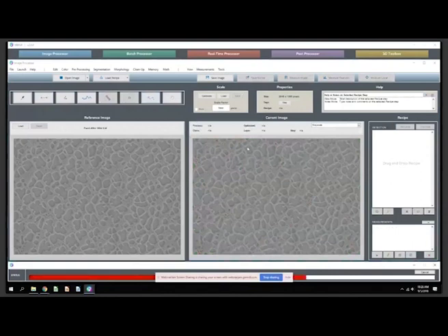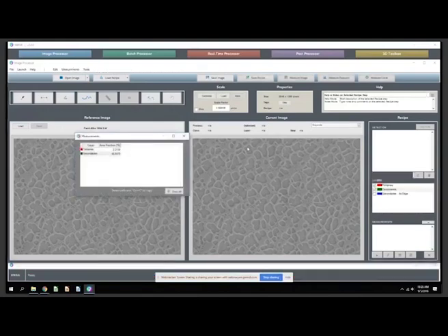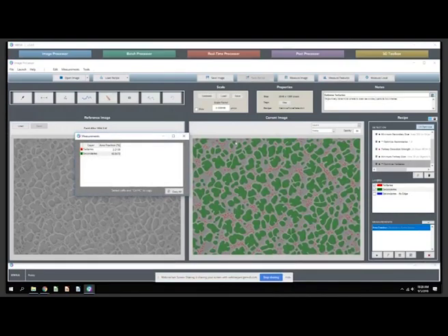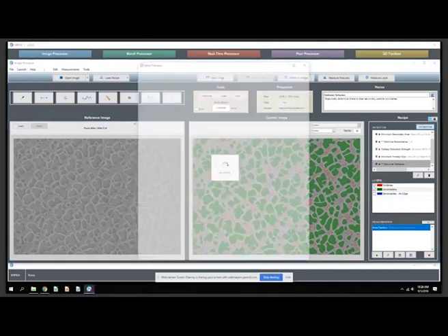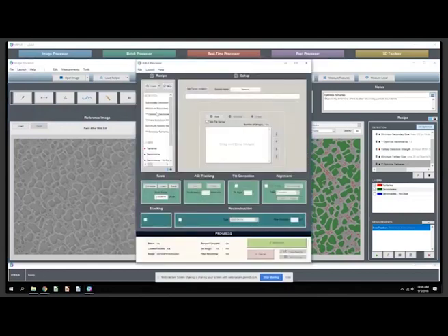on the next image. So if you've got between 5 and 10 images, some users just choose to quote unquote batch process this way, drag in an image, click a button, get your next image results. But if you've got more than 10, you're probably going to want a batch processing workflow. So right from the image processor, we can say launch batch processor. That's going to bring in the recipe for you. Done. And now we're just going to take the images that we want to batch and say go. This takes roughly 1 minute for these 3 images, maybe less.